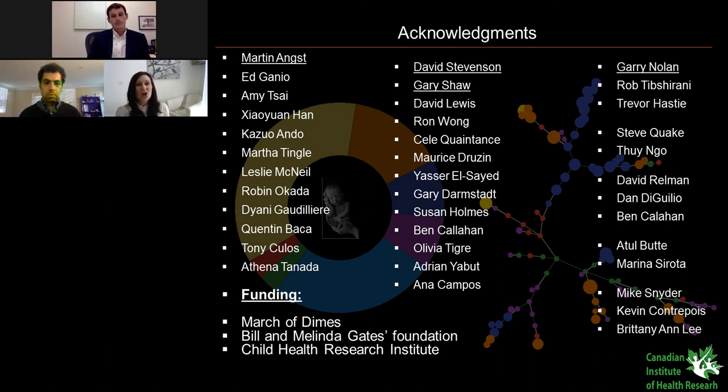Thank you. Our next question, mass cytometry dramatically increases the number of cell types and signaling pathways that can be measured. How do you control for false positives? All right, I can take that one.